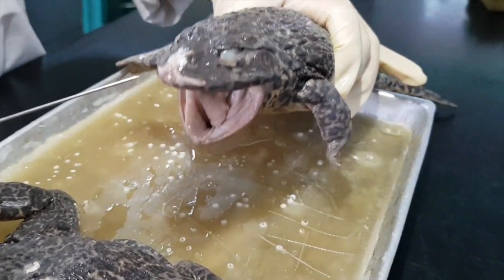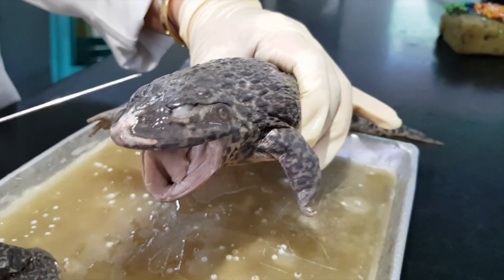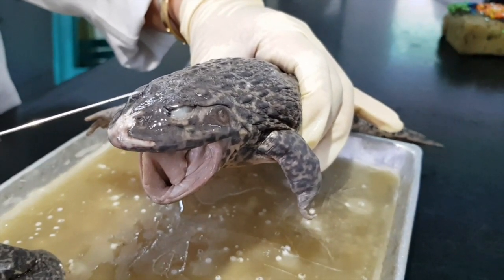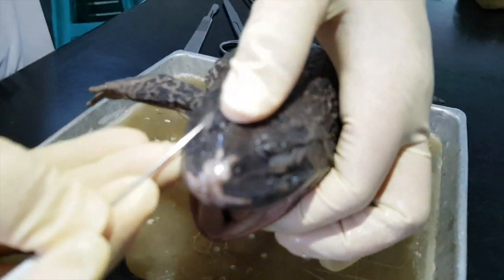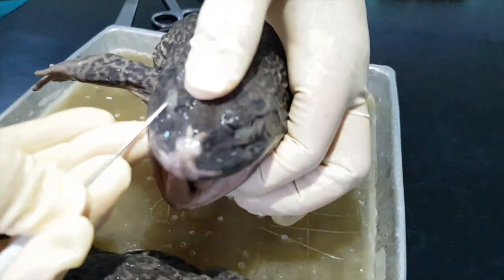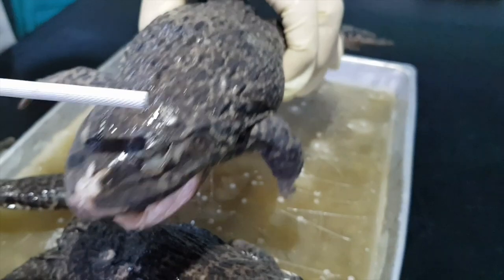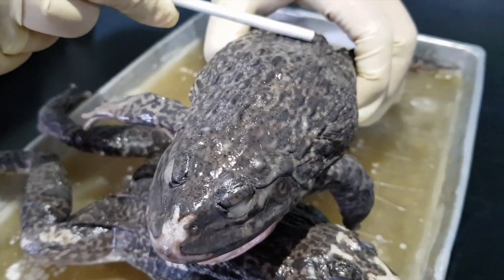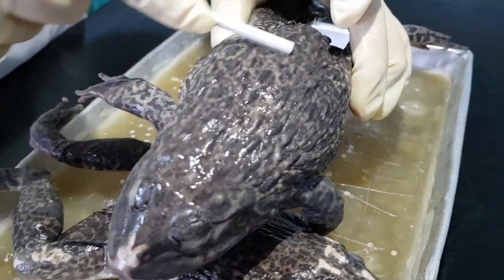you would see the presence of nostrils here and paired eyes with a film, a transparent membrane that covers it. It's the nictitating membrane. And then as you go downward, going caudal, you see a hump that is present here, the sacral hump.